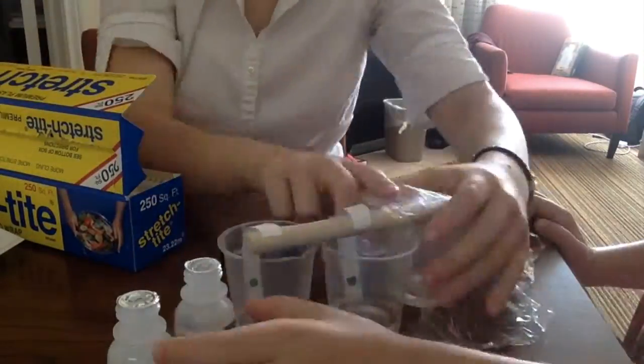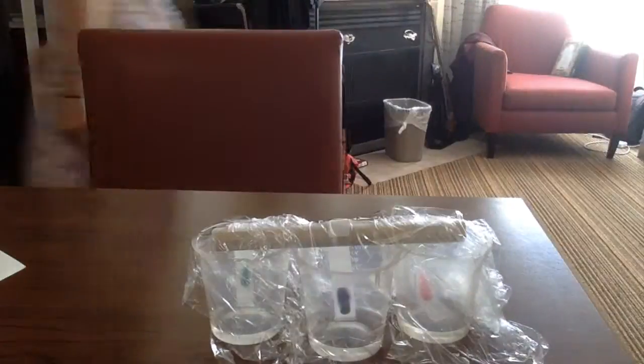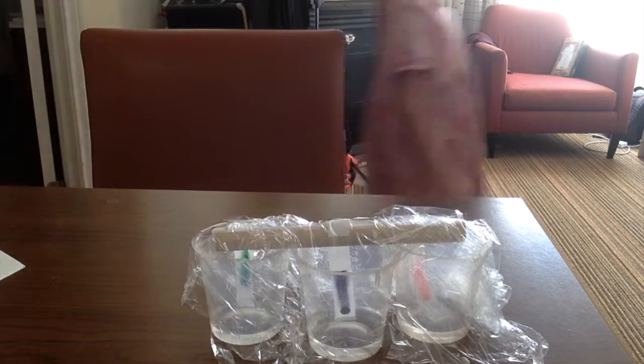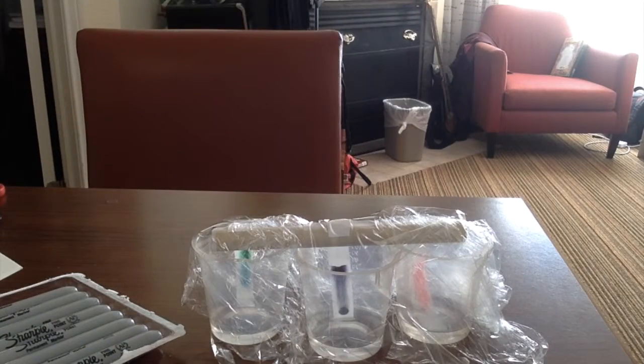It's called denatured alcohol. What is denatured alcohol? It's like normal alcohol, but not. Josie, do not spill these. What's in them? Denatured alcohol, which means it would be good for drinking if they didn't change it up. It's just like that kind of stuff, only they messed it up so that you don't want to drink it anymore. That's poisonous? Yeah. Why is that stuff poisonous? Because it's supposed to be.